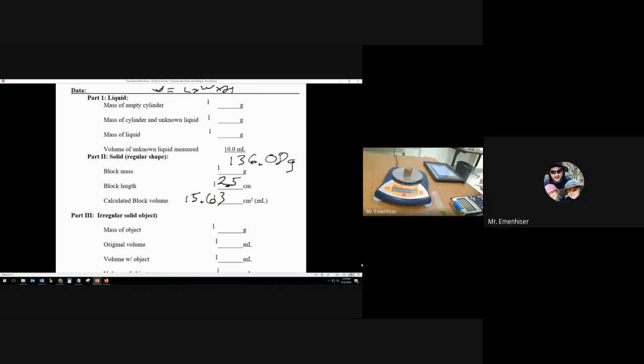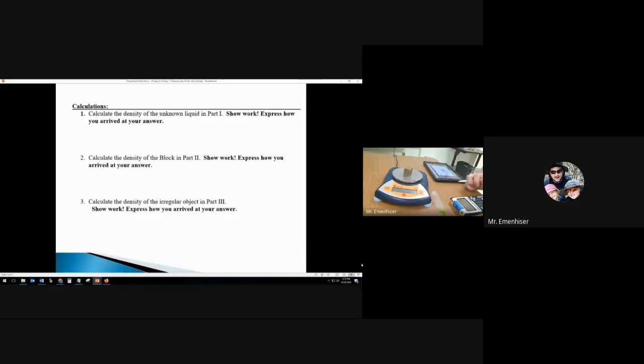And now I think I'm calculating the density, which I'll show you guys in a second. And maybe I'm writing the numbers down. I'm actually just putting the numbers on the calculator so I have the numbers later. Because I'm writing everything down on this iPad, and when I move on to the next slide, it erases it, so then I don't have the numbers anymore.